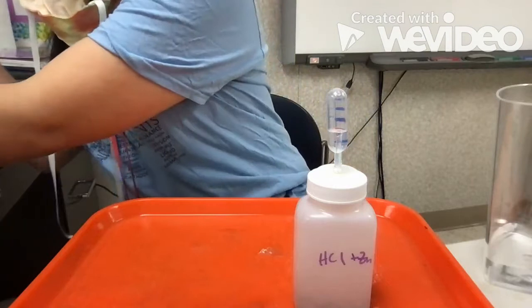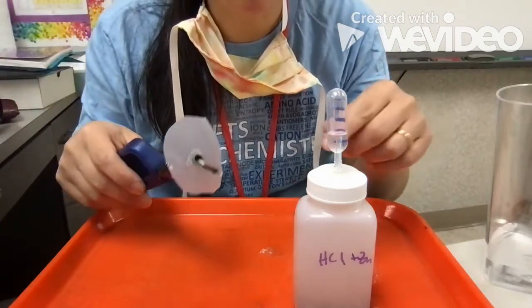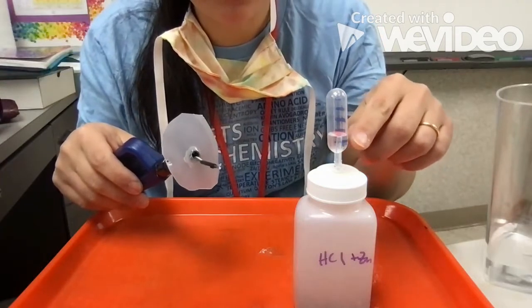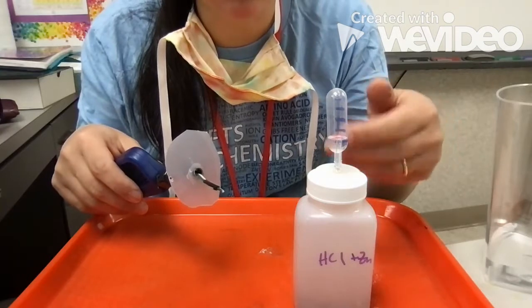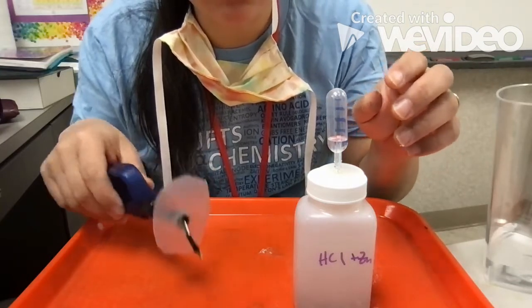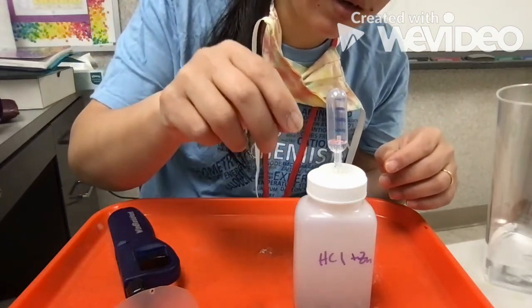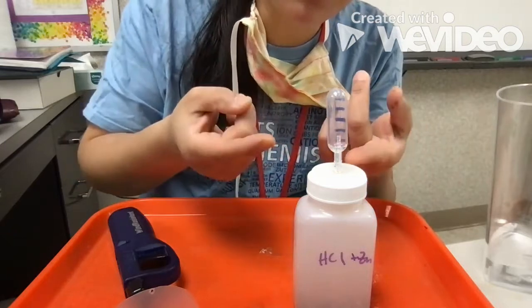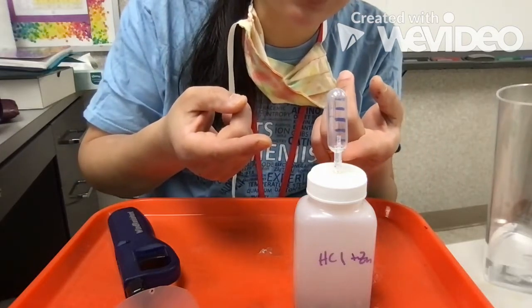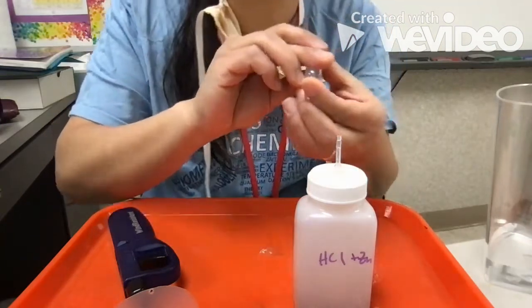And then once we collect the gas, we're going to take the rocket off, and it's important to take the rocket off as soon as it's done filling with gas. Okay, don't leave it on there because you're going to lose the hydrogen. Okay, so we're almost filled up. Okay, so when it's full, I'm going to take it off, and I'm going to put my finger over the opening so that gas doesn't escape out. Okay, so I'll take it off, and I'll hold it here.